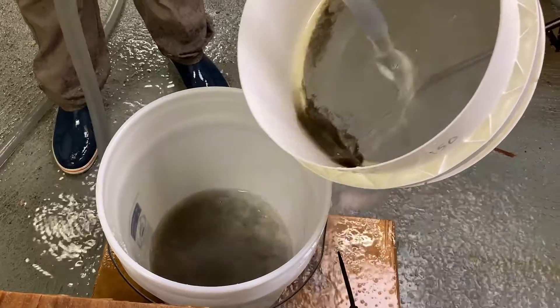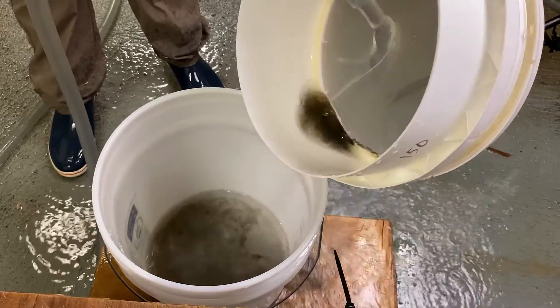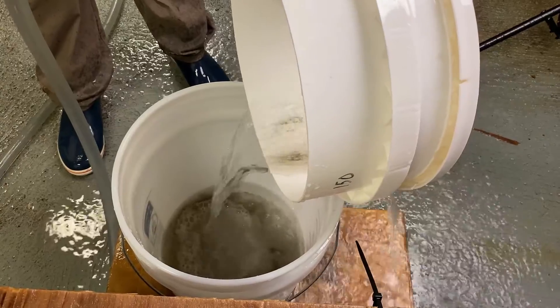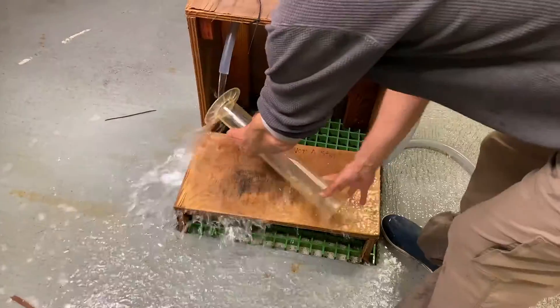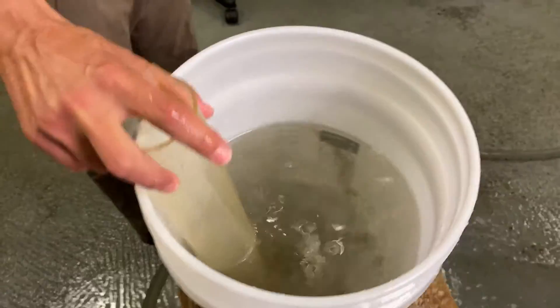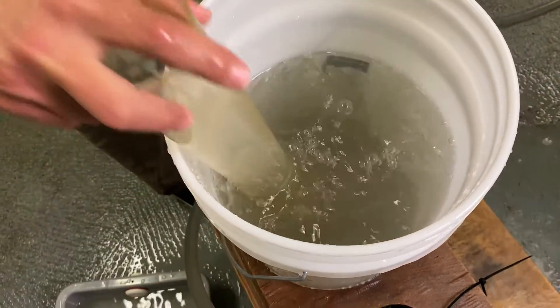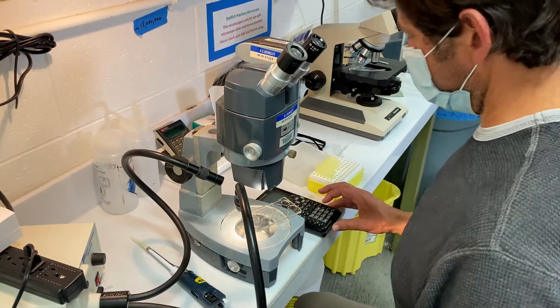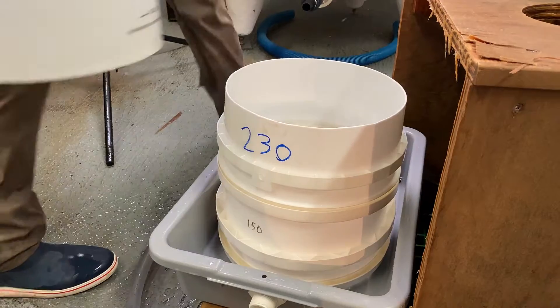Once you've added the larvae into the bucket with a set amount of water, Joe will calculate a concentration to ensure the right amount of larvae are put into each downweller. To determine the concentration of oyster larvae, we're going to use this graduated cylinder as a plunger to mix our sample. We will take multiple measurements and record the concentration under a microscope and then take an average.